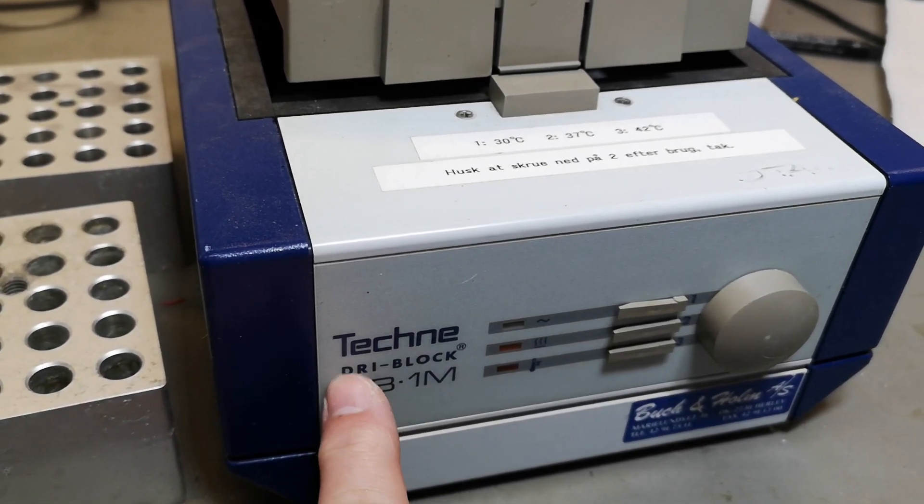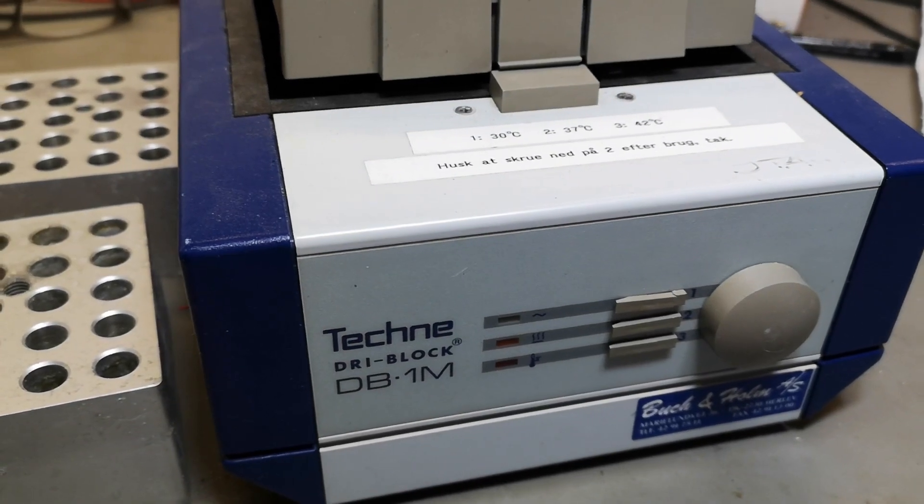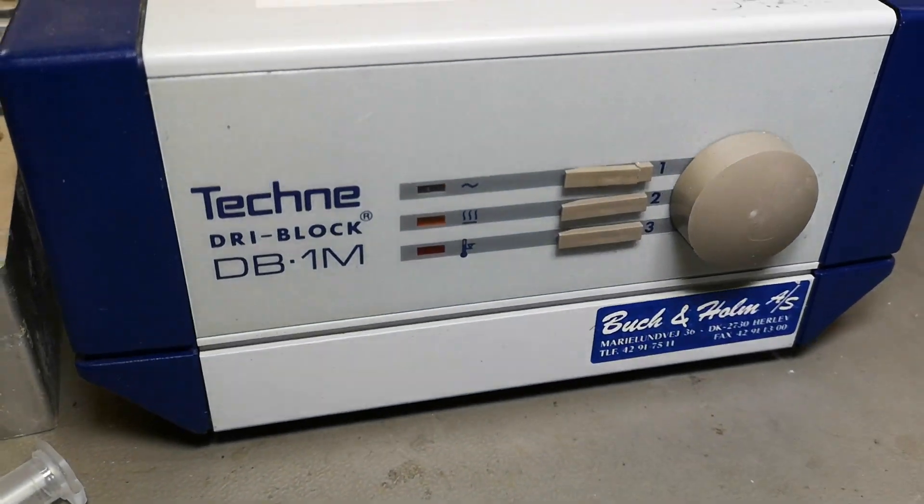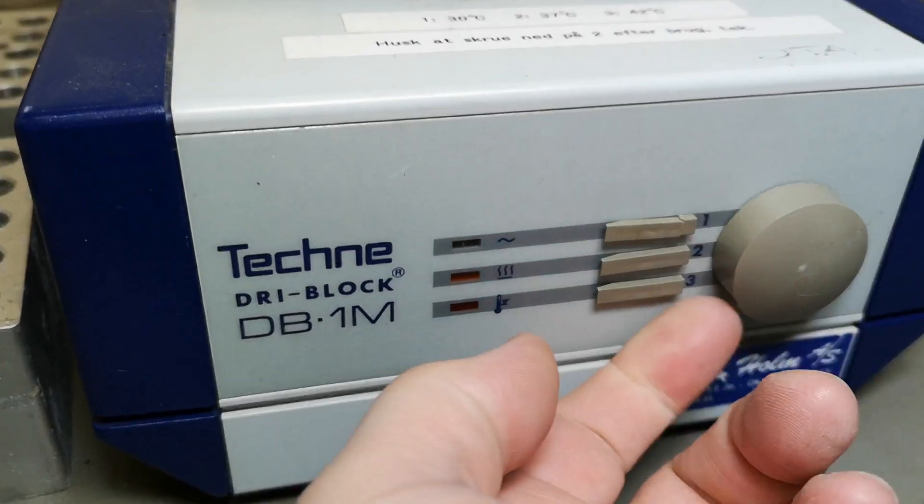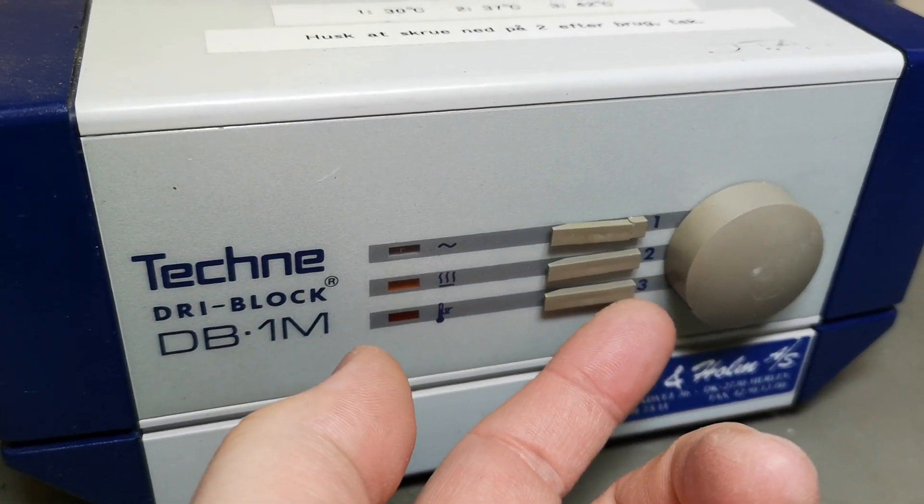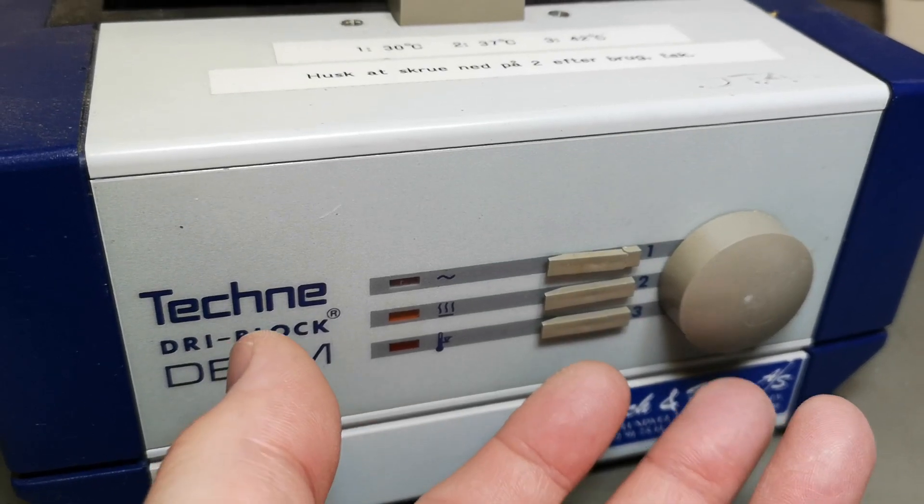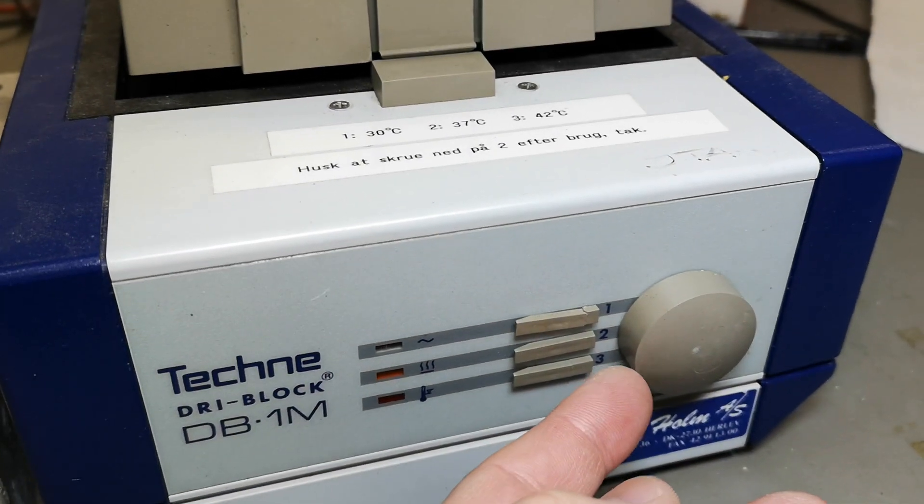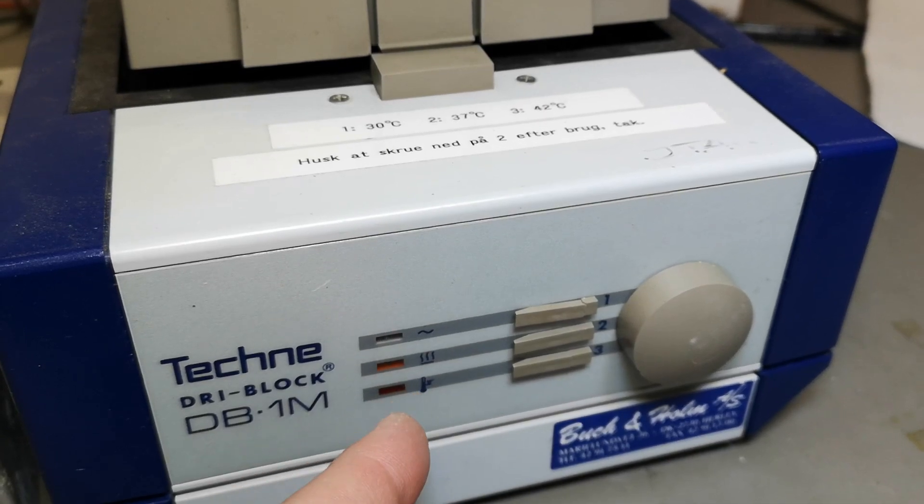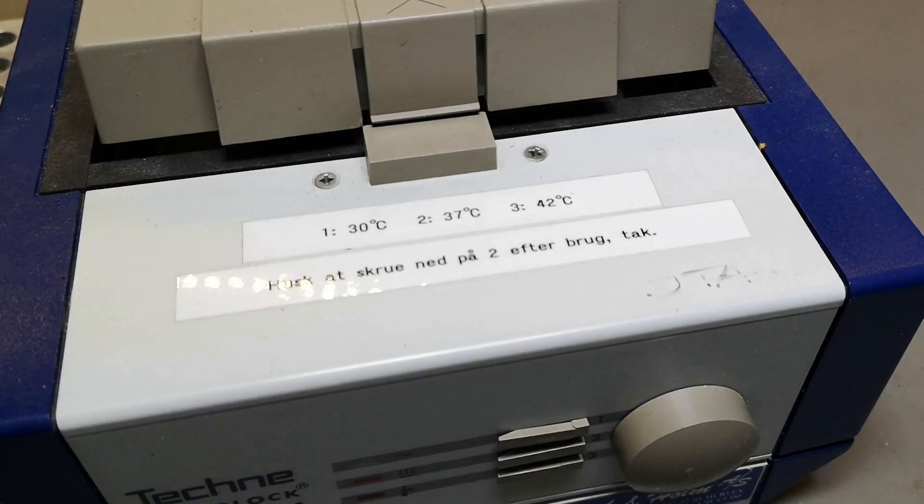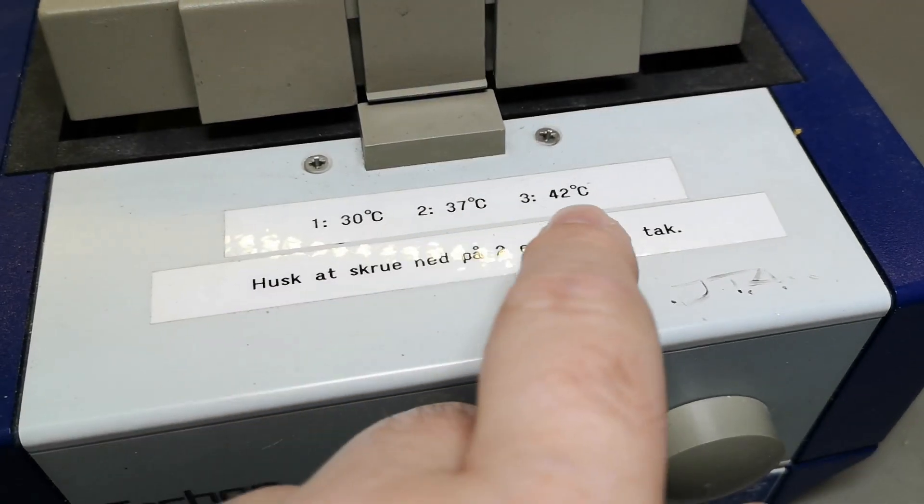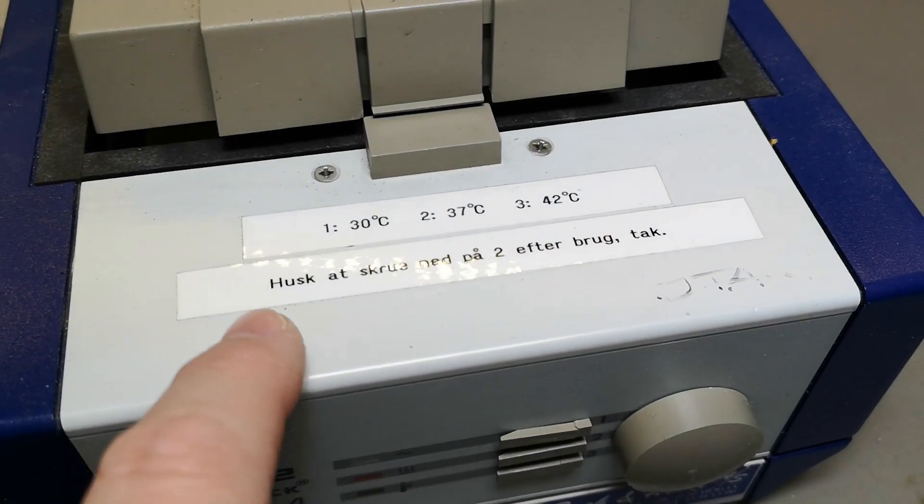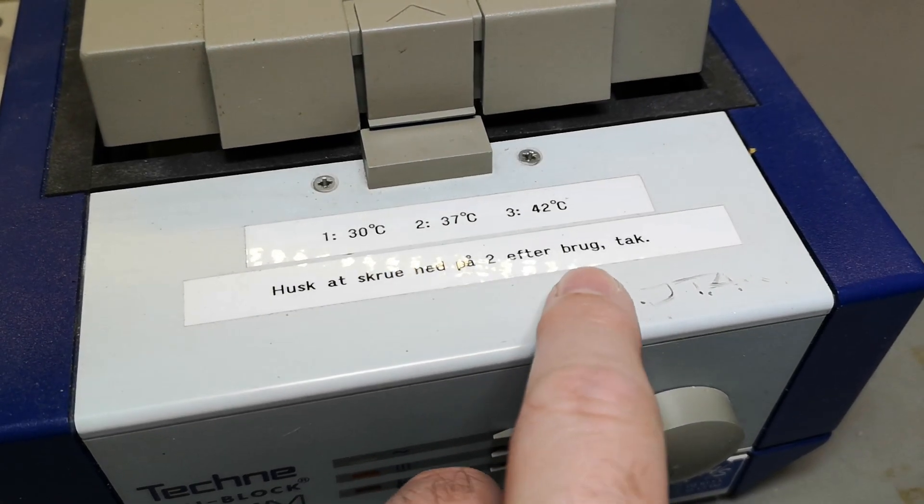As far as I can see, there is this dial with three different settings, and that is all there is to it really. The three different settings are pre-programmed somehow so that's the three different temperatures, and it says remember to dial back to number two after use.